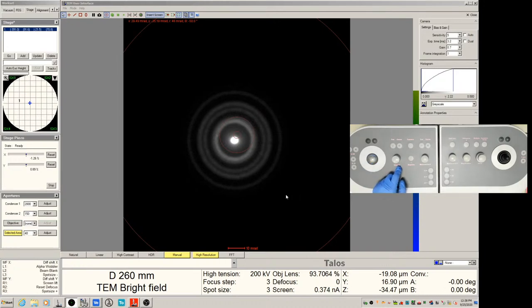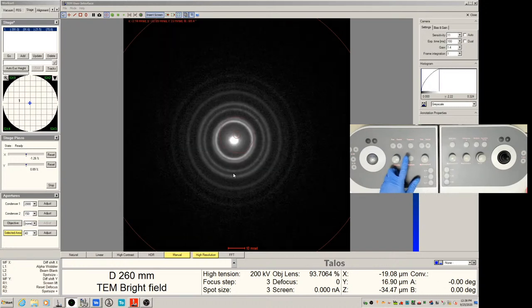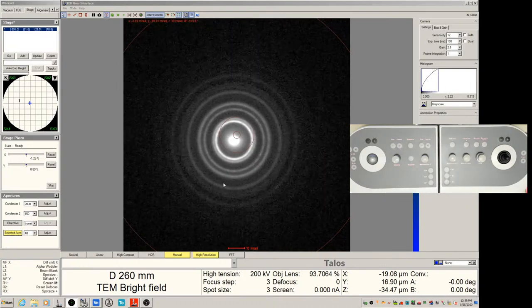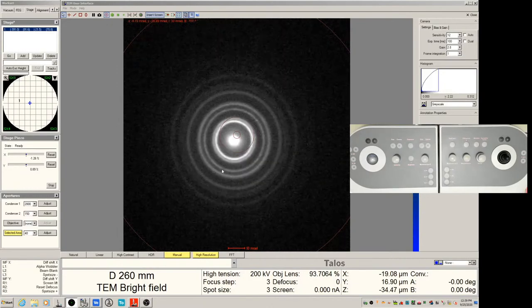And for the diffraction pattern, we will need the parallel beam. So we will change the intensity to clockwise. And you see now the diffraction rings are very faint. Only the center spot is showing up. But again, you can change the brightness contrast using the mouse wheel button on the flu cam so that you can still see the rings. Okay.